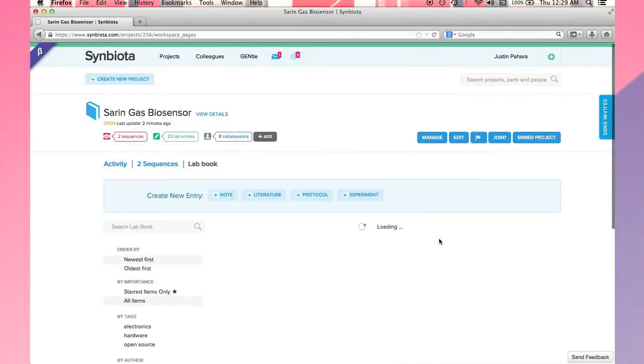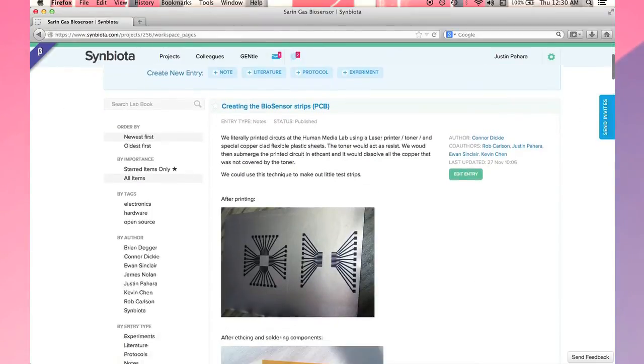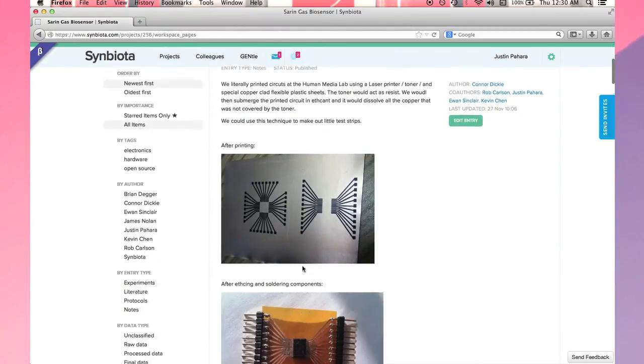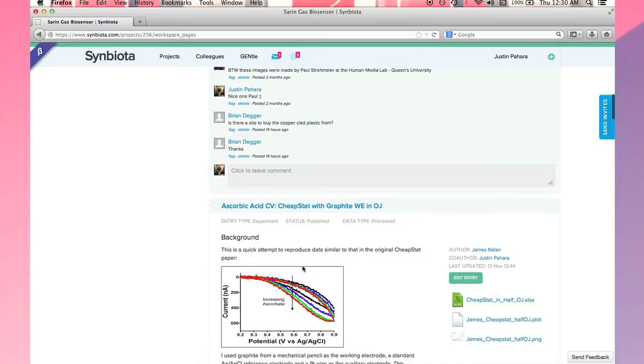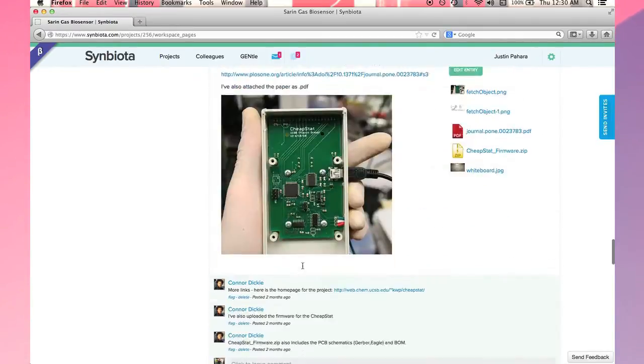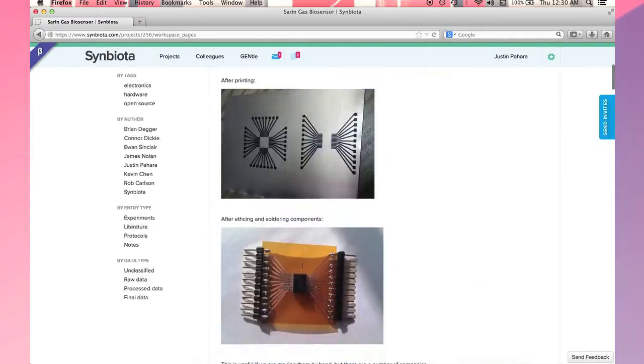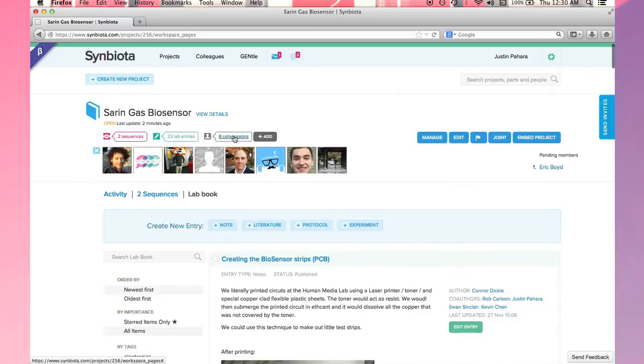This takes me directly to the project lab book. Here I can see all of the lab book entries created by myself and all of my collaborators. In this case, I have eight collaborators in the project hailing from several different continents.